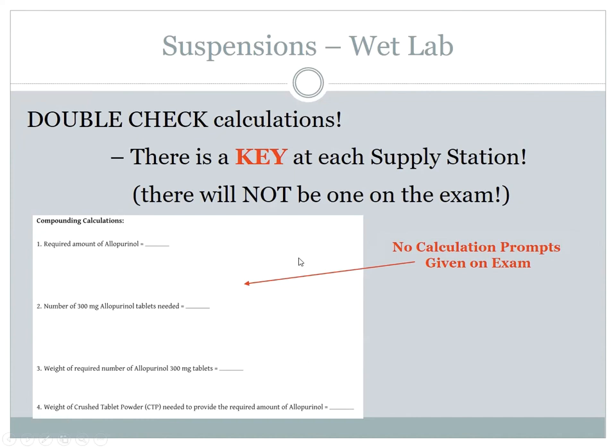So in the exact method, you're not going to make more, so you're going to have to obtain the right amount of drug. So you're going to have to round up to a number of tablets, do the weights, and remember, since it's a tablet, it weighs the same as a tablet as it does as a crushed powder, so don't crush it yet. Just get the number of tablets, having rounded up, get the weight, and set up the proportion. The active ingredient in your number of tablets divided by the weight of those tablets equals the active drug that you want divided by X. And you can solve for, therefore, the amount of powder that provides you the amount of allopurinol you need, okay? That's what I'm saying, in the exact method, you have to do that work. It's not as easy as the excess method. Nevertheless, if you've done that before, you can do it.